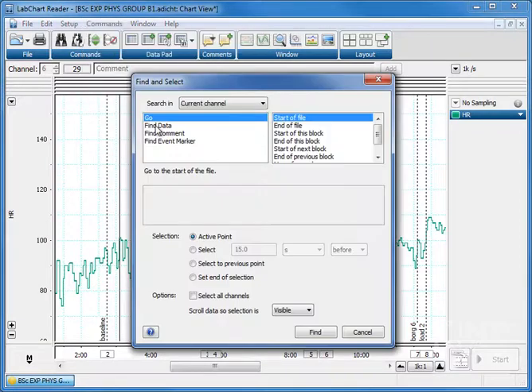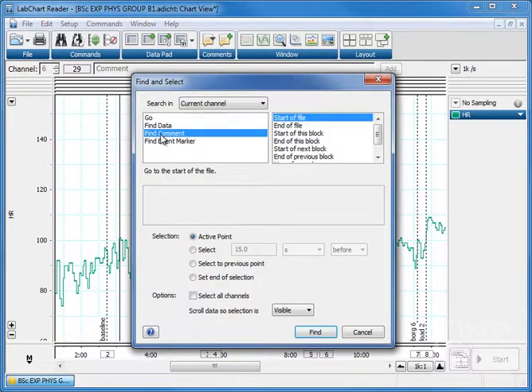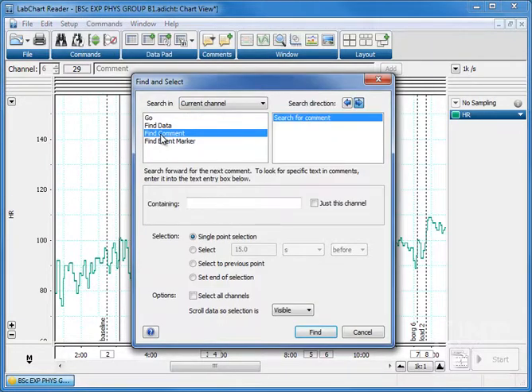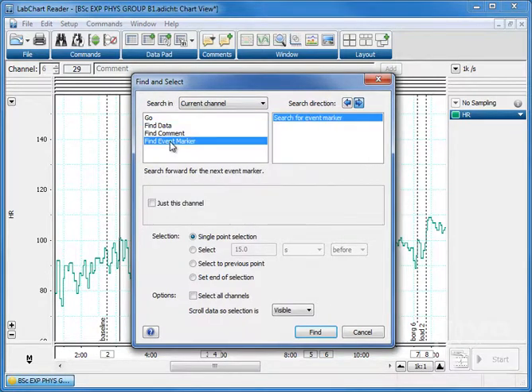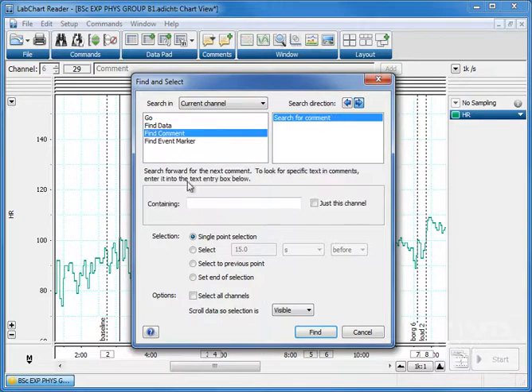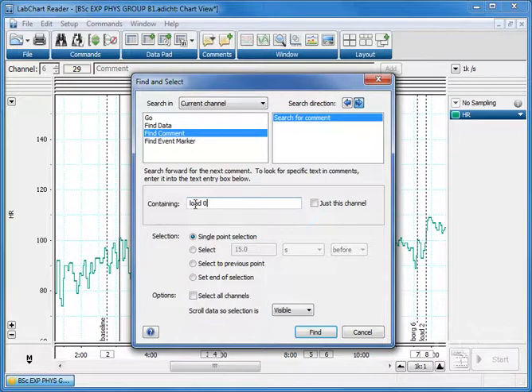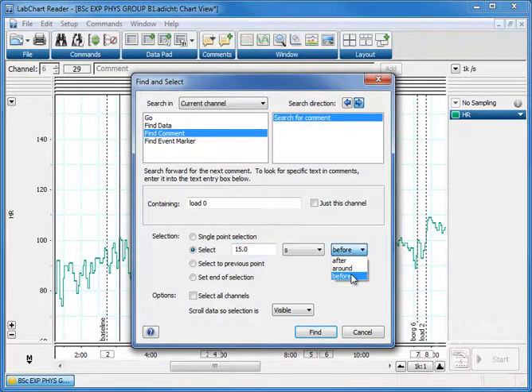You click on find and you want to find a comment. You want to search for a comment. You could find data, you could find comments, or you could find event markers, but we want to find comments and we're looking for the term load zero. We're going to select 15 seconds before.